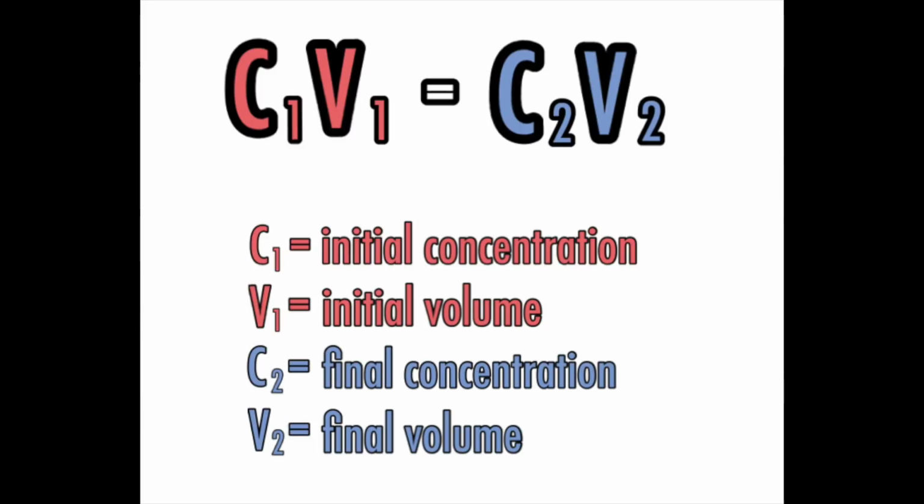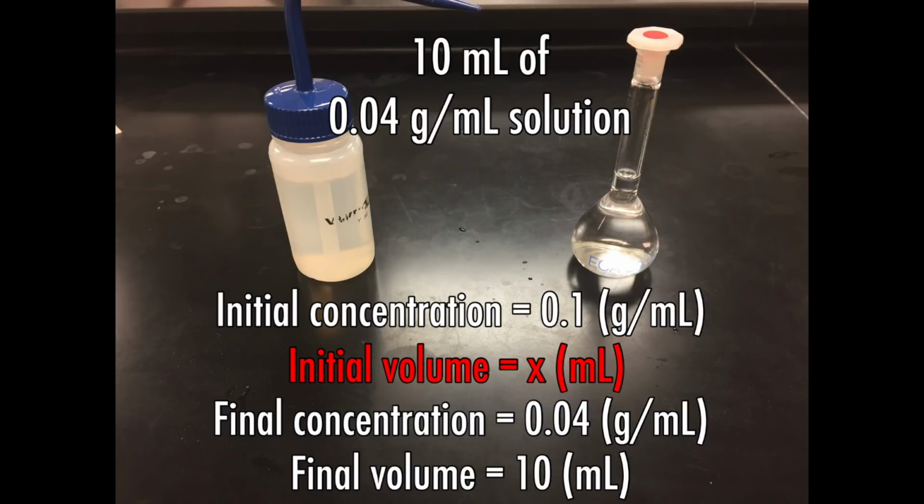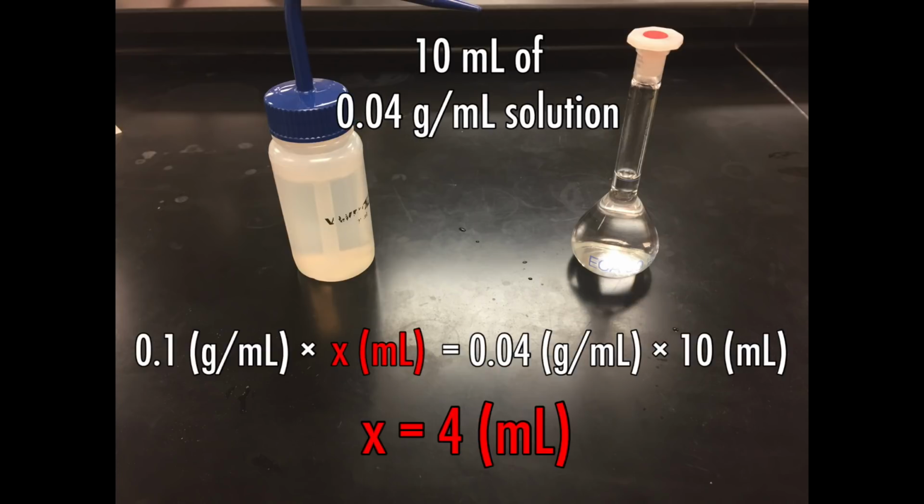In order to calculate the volume of the original solution to measure, use this formula. For example, when you want to make 10 milliliters of 0.04 grams per milliliter solution, the initial concentration of the original solution is 0.1 gram per milliliter, the final concentration is 0.04 grams per milliliter, and the final volume is 10 milliliters. X in this case is what we want to know, which is the volume of the original solution you need to add. So now you can build this equation and solve for x. X is equal to 4.